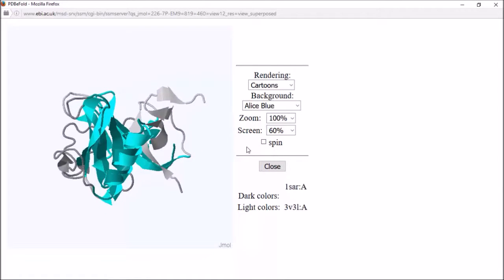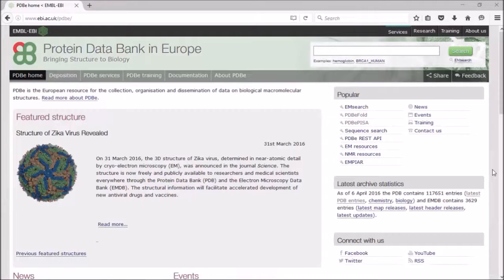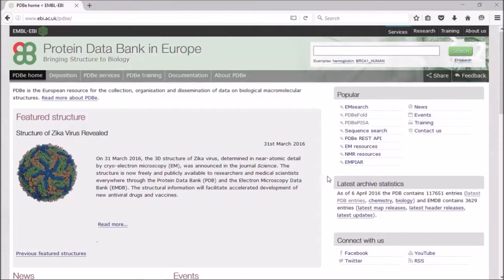Another of our tools is PDBe PISA, and you'll find the link here on the top right, which will take you to the PISA server.